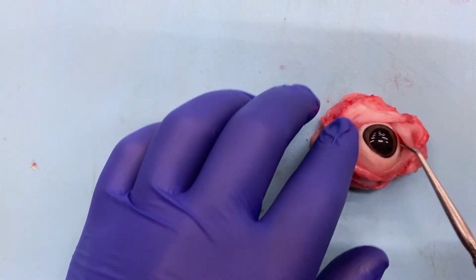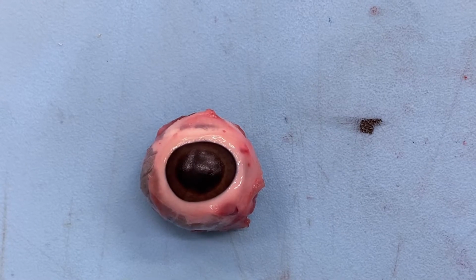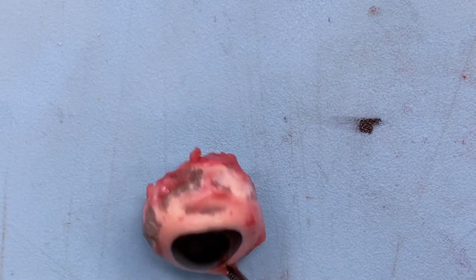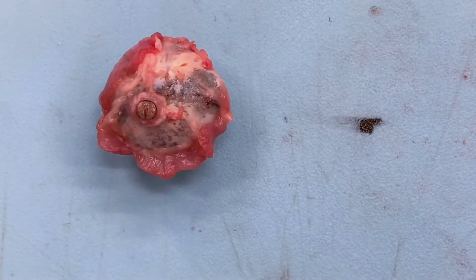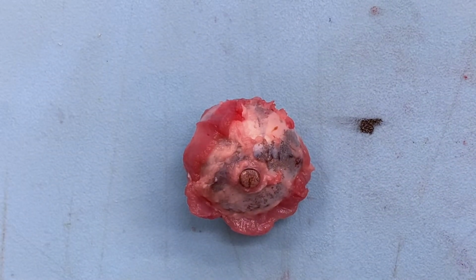So I'm going to go ahead and remove the skin and soft tissue from this specimen, and we'll look at what an enucleation specimen should look like. So this is what you can expect to see with your enucleation specimen. Notice there's not a lot of soft tissue attached, and there's scant amounts of musculature. Honestly, you can often use the muscles to orient your specimen, but we can go ahead and try. I tried to leave some attached, but don't worry about it. Typically, orientation on these specimens is not critical unless they did it in the surgical suite, or if you happen to notice any sort of extension of tumor into the surrounding sclera. But let's go ahead and take a look.